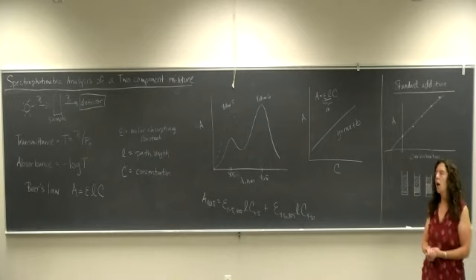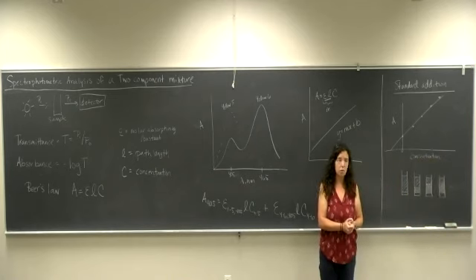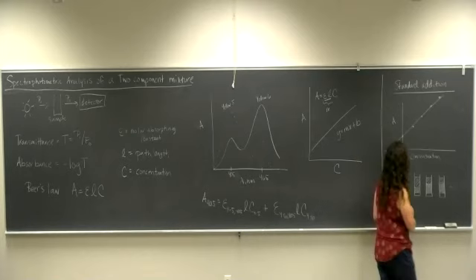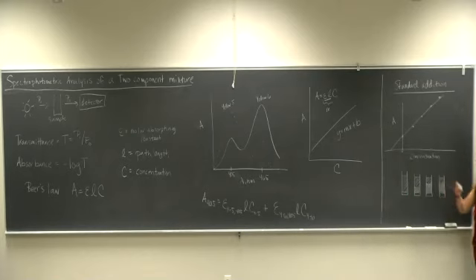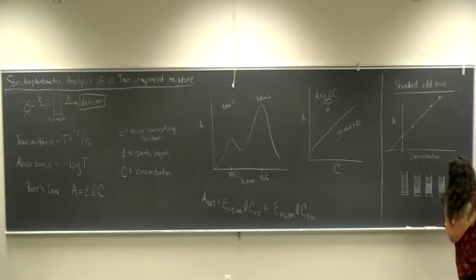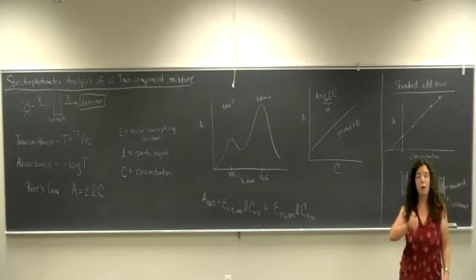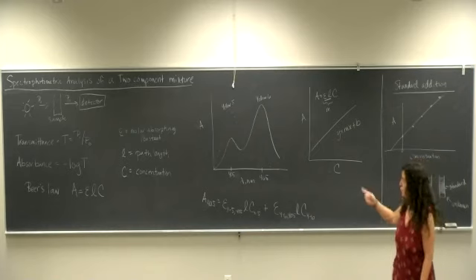And so sometimes the other method that we can use is a standard addition method, in which you prepare your samples similar to how you do for the standard calibration, but in this, you'll always have the same volume of your unknown that you're trying to determine the concentration of. Then you'll have some varied concentration of standard, just as we did over here.